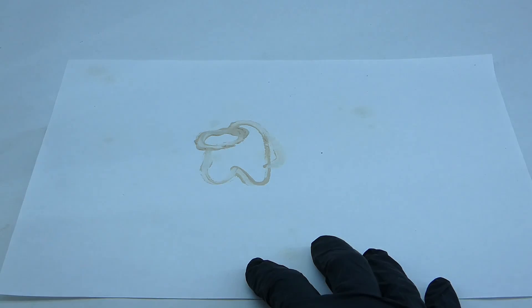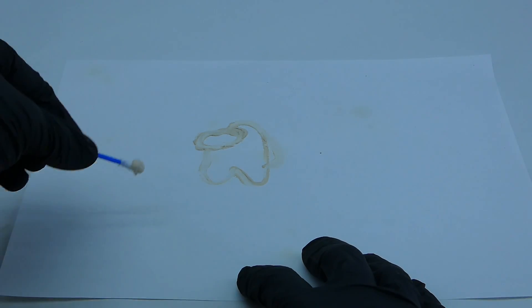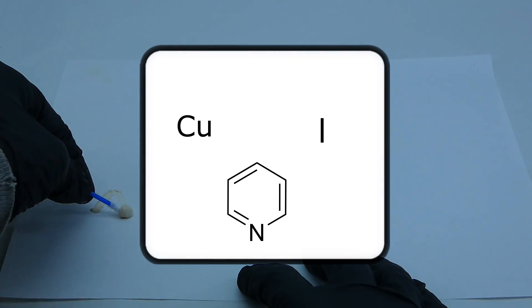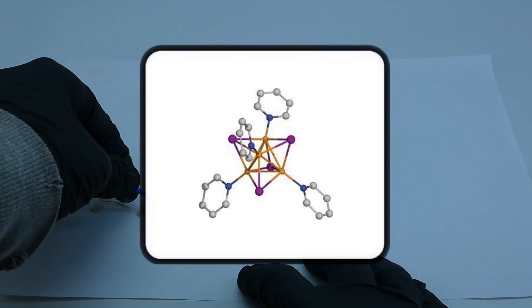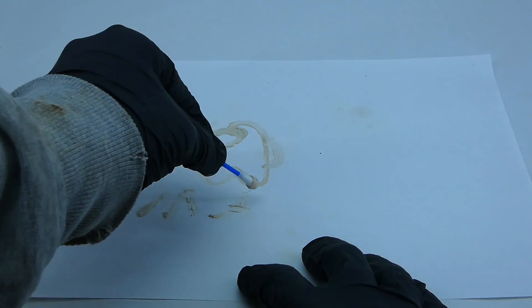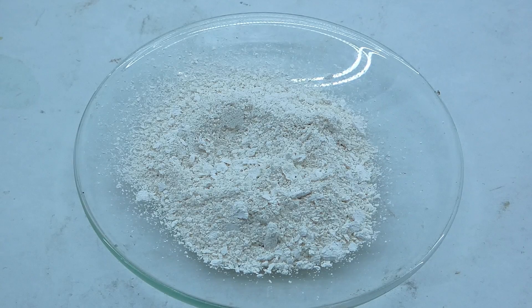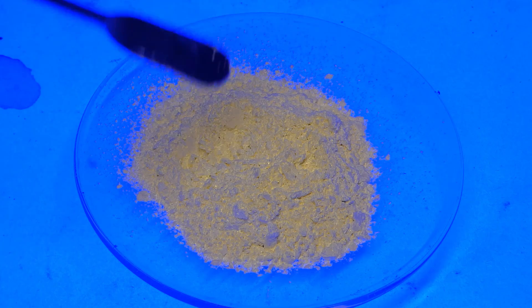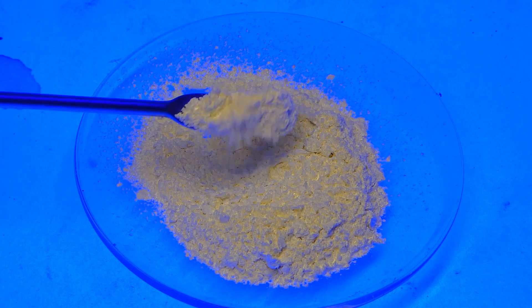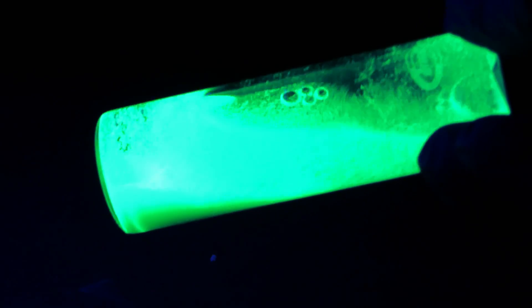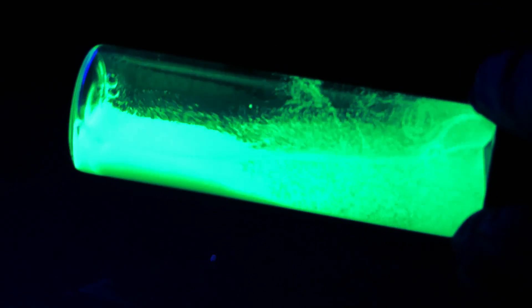The complexes that I am going to be making today consist of copper, iodine and pyridine, arranged in a pretty unique way, that look like just some random white and yellow powders under normal light, but when subjected to UV, they emit beautiful yellow, green or blue light, and I think that just this makes synthesizing them a very rewarding experience.